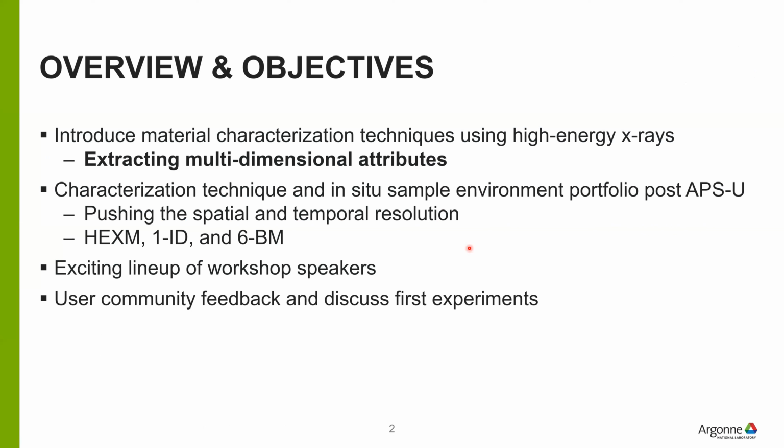The basic idea is that we want to extract multi-dimensional attributes from voxels or sample points, and we want to also introduce through the talk various characterization techniques and in situ sample environment portfolio that will be upcoming after APS-U. That'll be pushing the spatial and temporal resolution. We'll be talking about the beamlines that would be operating in the future.